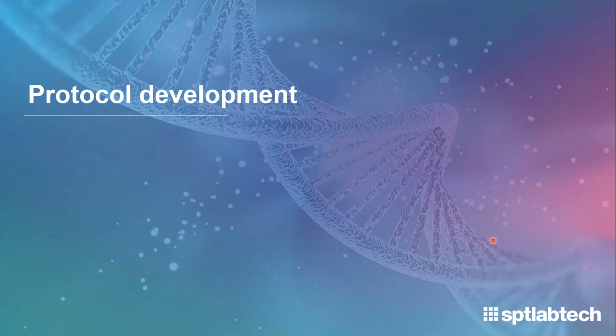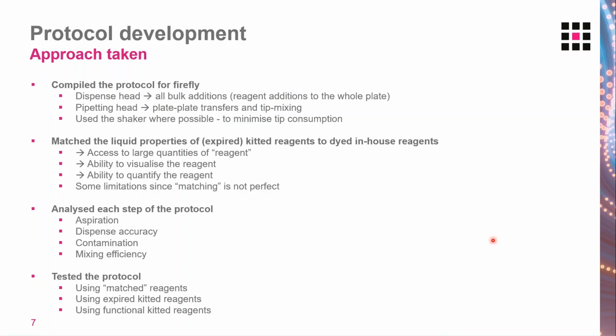So this is the approach we've taken, quite a long approach. To start with, when developing a protocol for Firefly, we start by determining which head to use for each dispense. So we typically use the dispense head, the positive displacement head, for all bulk additions of reagents. By this I mean reagent additions where we're dispensing the same reagent to all wells of the plate.